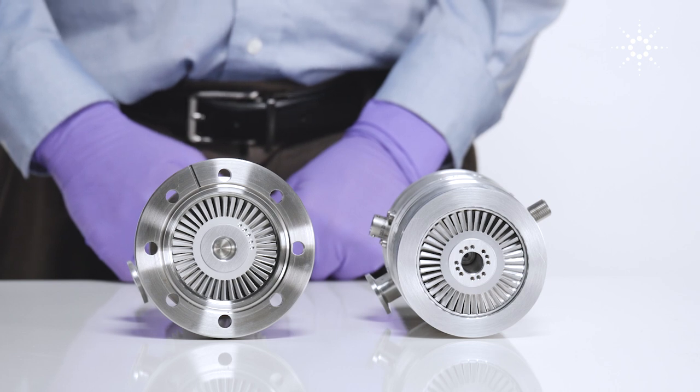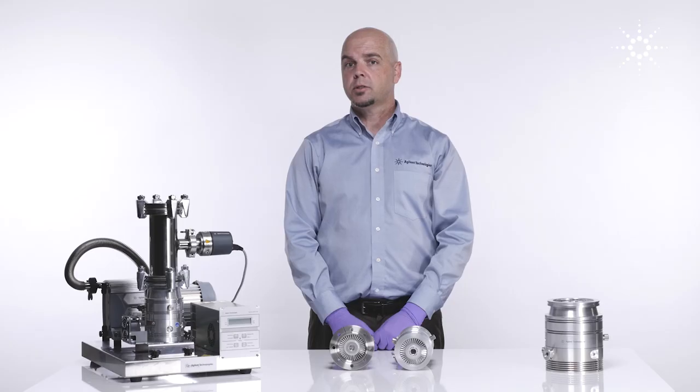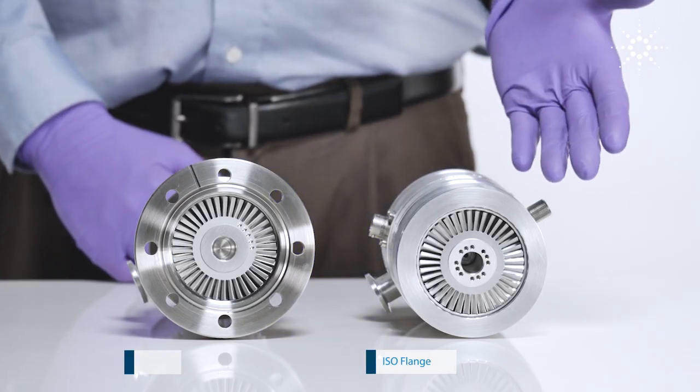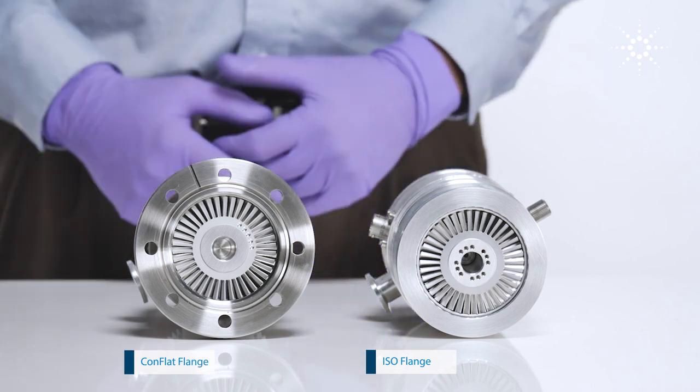So let's begin with a quick tour of the turbomolecular pump. Turbopumps come in multiple types of flange styles which can be connected to your vacuum chamber — the ISO flange or the ConFlat flange, depending on your vacuum requirements.